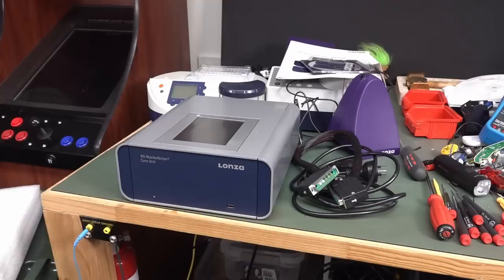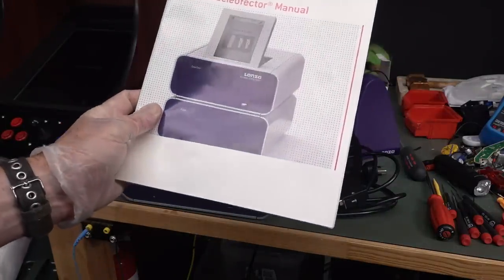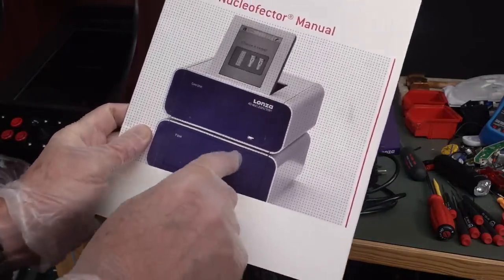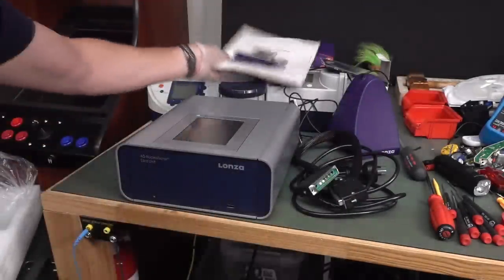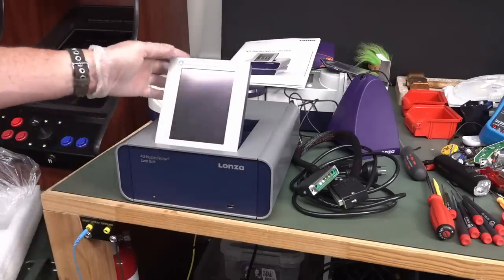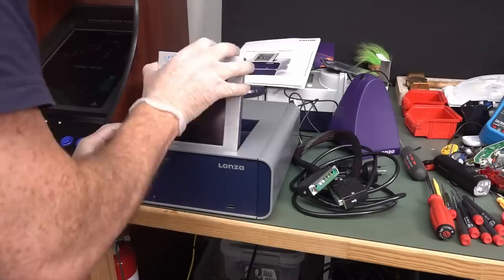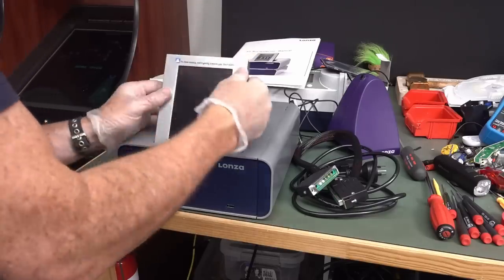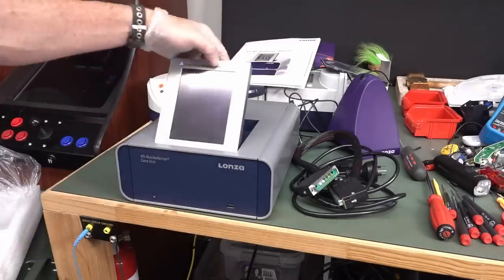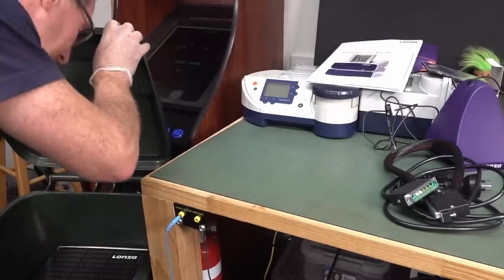4D Nucleofector core unit. That manual showed that it had, is there an X unit as well? Maybe I've got the X unit down the bottom. That'd make sense. Double check the dumpster. That's just a display. To close the display, pull it gently towards you. Don't push. No. Okay, it's not going back down. Okay, I've goofed that. I have no idea what the trick is there. Okay, let's see what else.